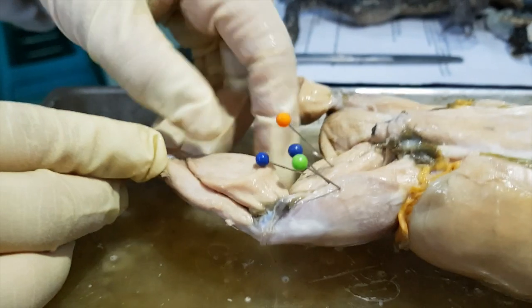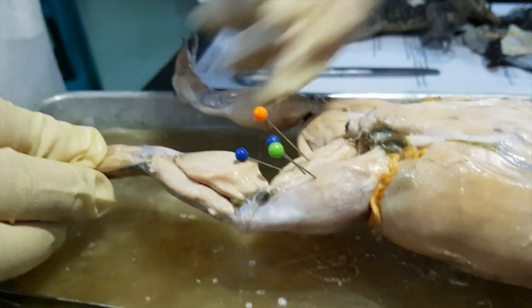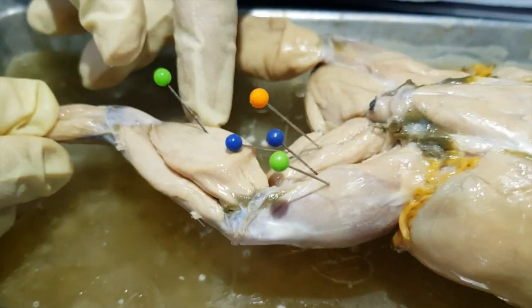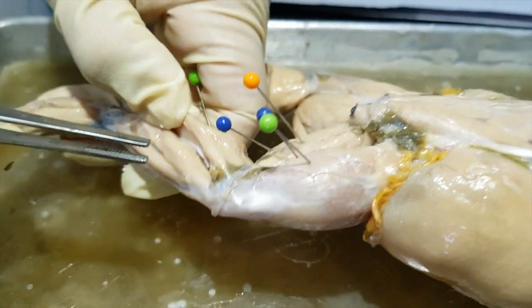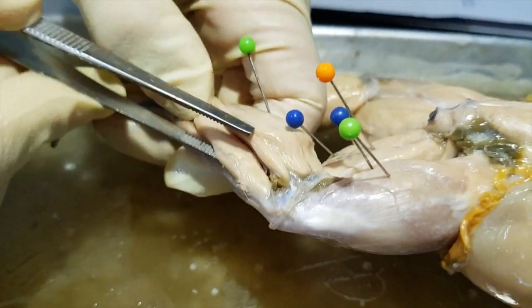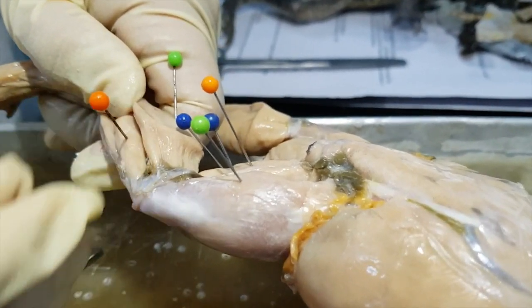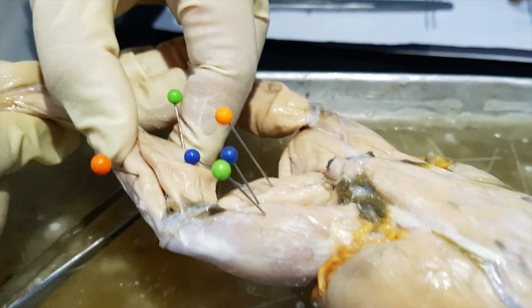This big muscle, triangular in shape, which all goes towards the tendon of Achilles, is the gastrocnemius, which can also be seen on the ventral side. Okay. This flat muscle here is the peroneus. So this is again on the dorsal side. So peroneus can be seen on the dorsal side. Gastrocnemius can also be seen on the ventral side. Okay.